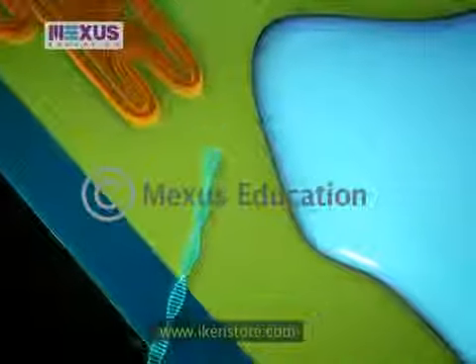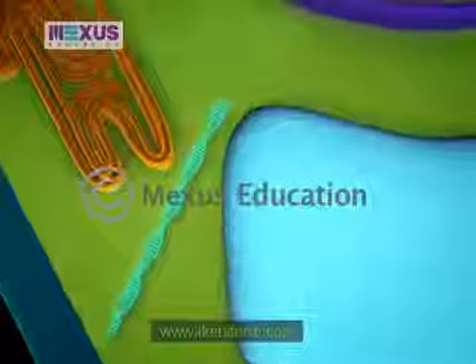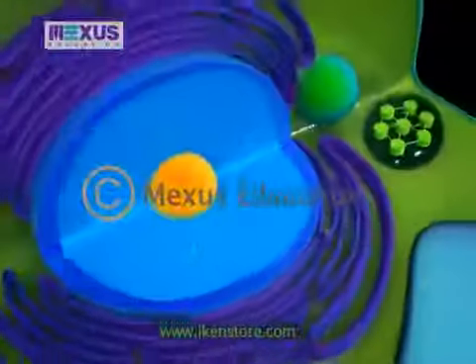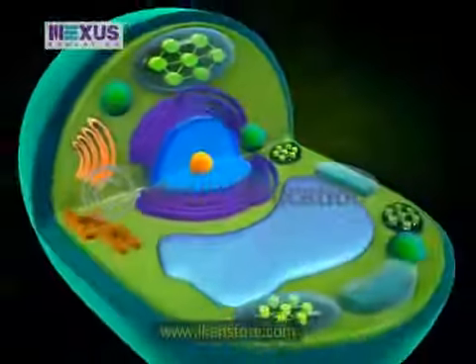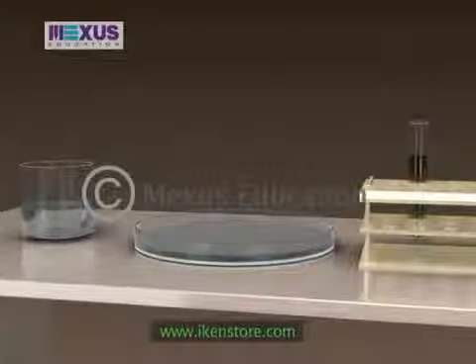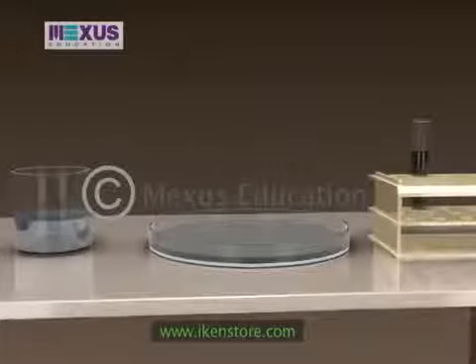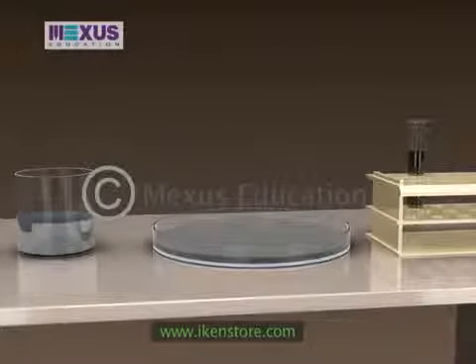The spontaneous uptake of DNA by plant cells is quite low. Therefore, different chemical and physical treatments are employed to facilitate the entry of DNA into plant cells. Let us learn different methods used for direct gene transfers.